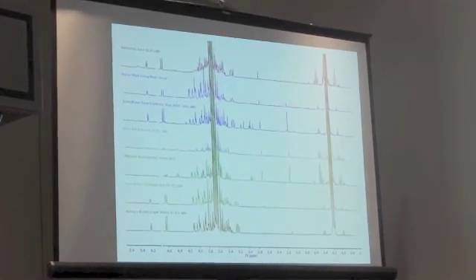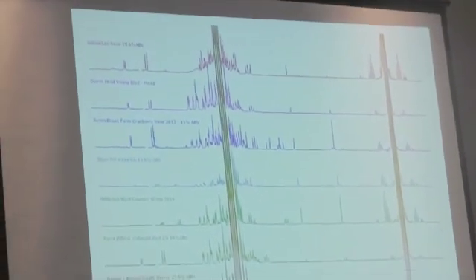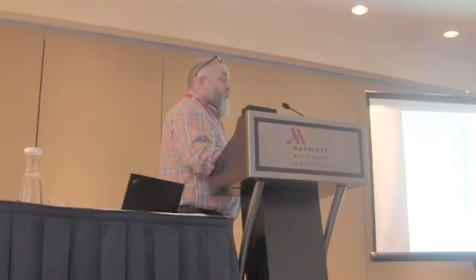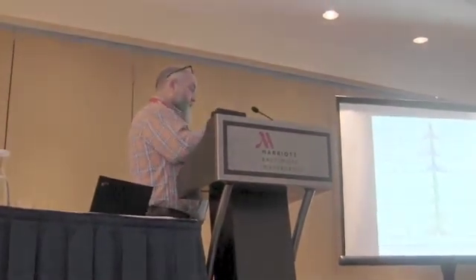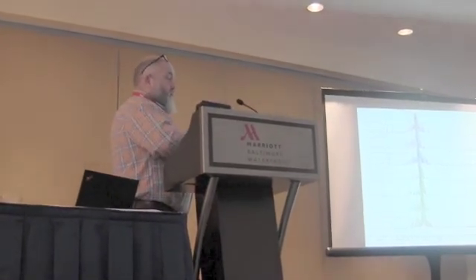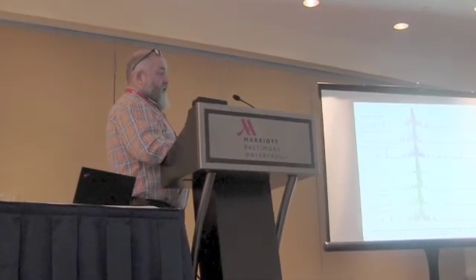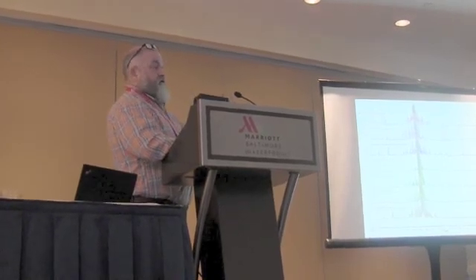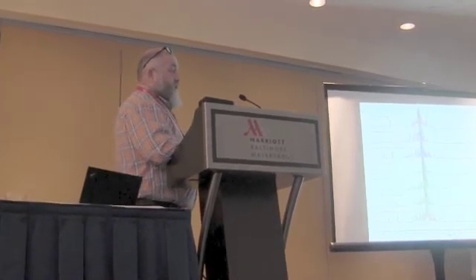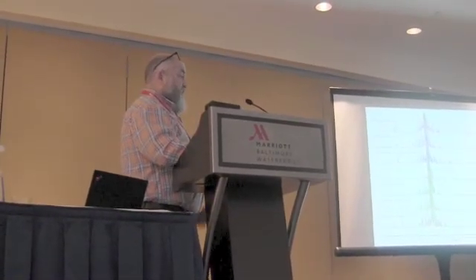The trouble with mass spec and HPLC is that you have to cherry pick what things you're looking at in the sample. You can completely miss something big that went wrong, or get very blinkered and think everything's fine when something isn't. That's why the drug industry is really interested in this, because you see everything. If it's supposed to be a pure drug, but there's something in there that doesn't have an ultraviolet chromophore that the HPLC detector can see, it could be there. I watched a guy from Europe where something was in there at 50%, and the HPLC didn't even see it. They thought the purity was 99%, and it was like 48.